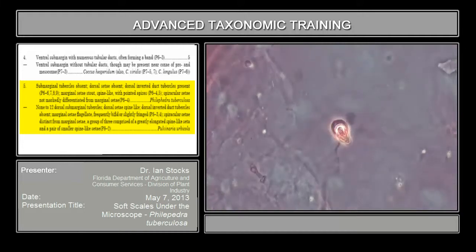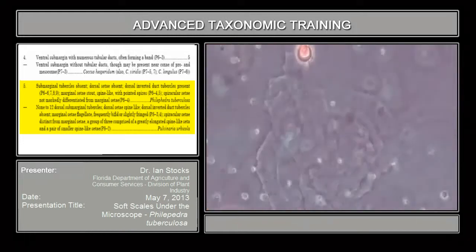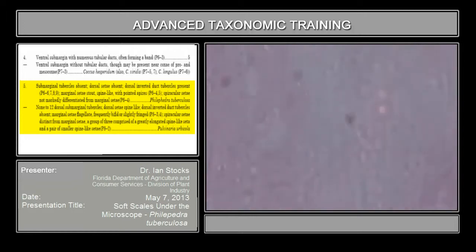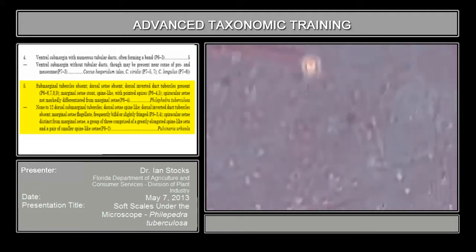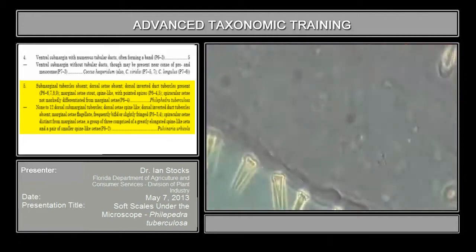And if I try to find another one, the opening of that sort of mouth type opening of the tubercle has in and of itself a fairly complicated morphology.